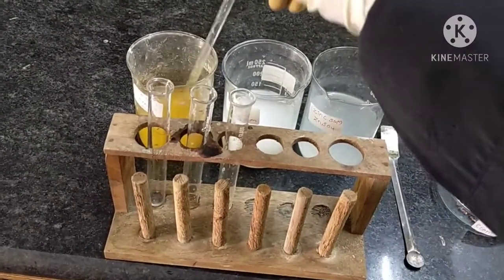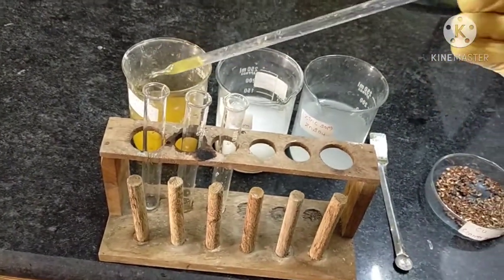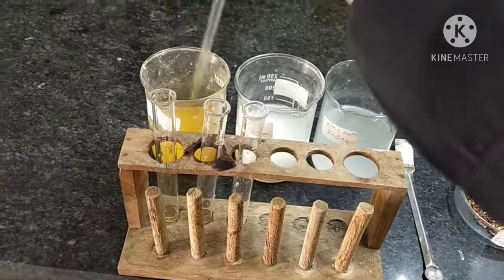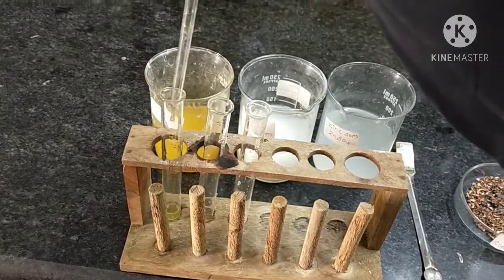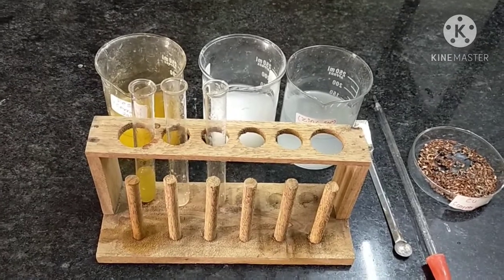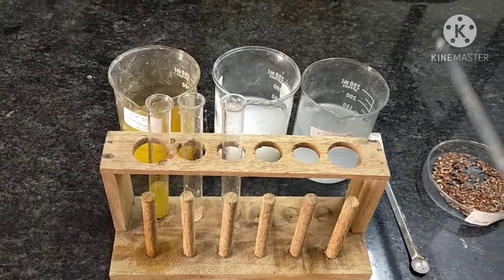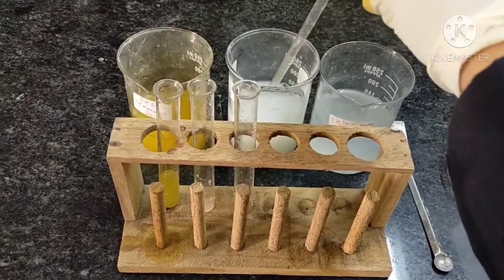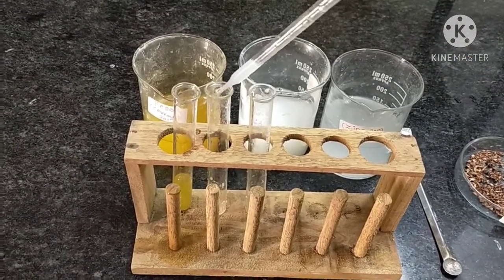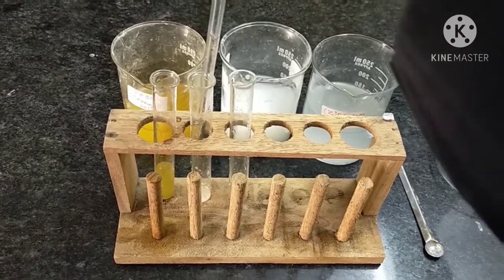Take a dropper and add a few ml of ferrous sulfate solution and pour into the first test tube with the help of a dropper. After adding ferrous sulfate solution in the first test tube, now we will add aluminum sulfate solution in the second test tube. Take a dropper and add two to three ml of aluminum sulfate solution into the second test tube with the help of a dropper.